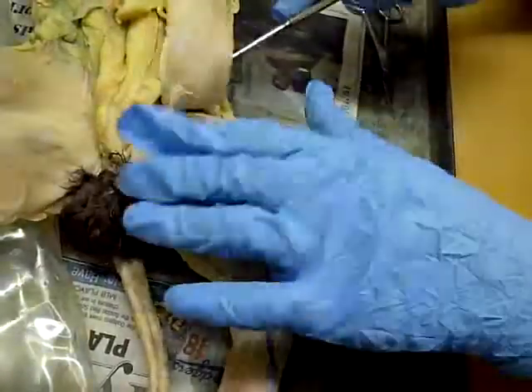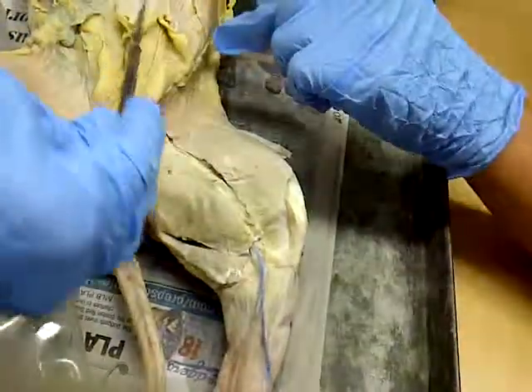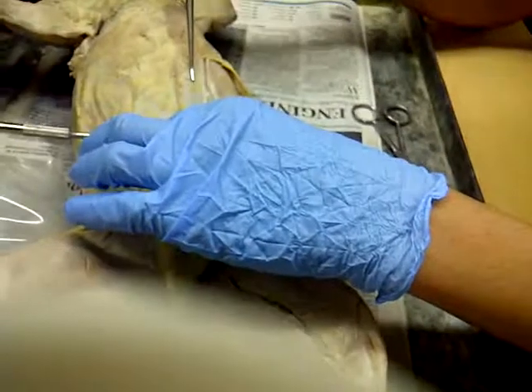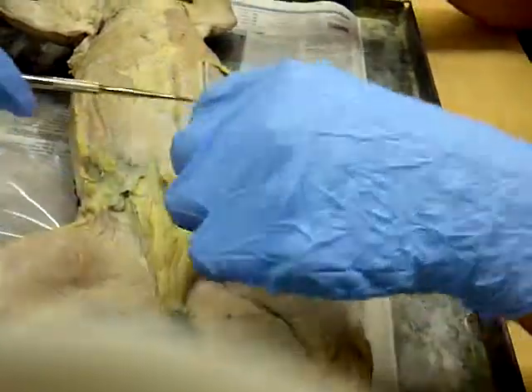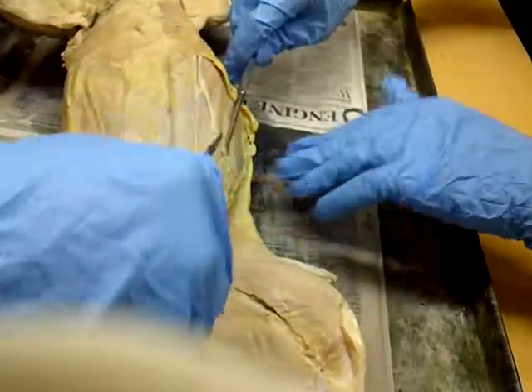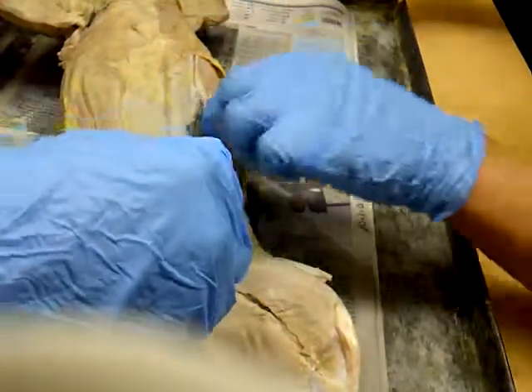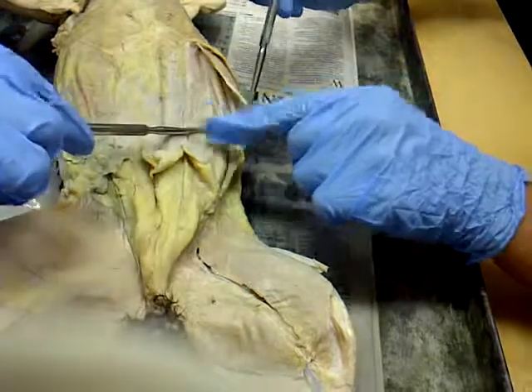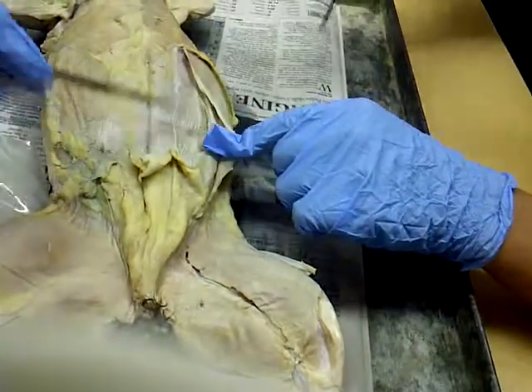Now we'll go back to the abs before you guys have to move again. The line down the middle is called the linea alba. On the sides, rectus abdominis. The section going into your front pocket is your oblique: external oblique, internal oblique. And transverse abdominis. Good job.